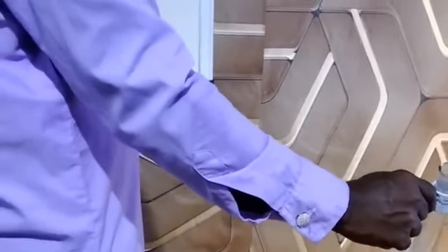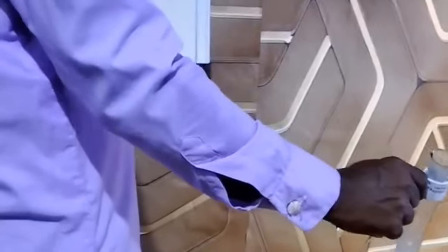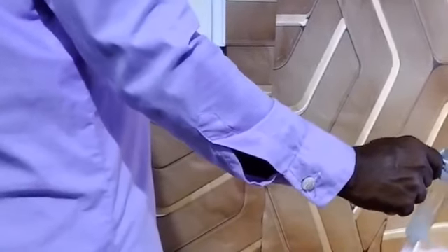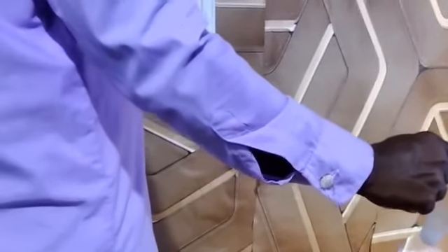As I said, as you heat, you try to rotate the boiling tube over the Bunsen burner. Don't keep it in one place so that it will not burst. That is the precaution you should take. Let's heat it to boiling point and see what happens. Keep it away from your face and your neighbor's face as well.